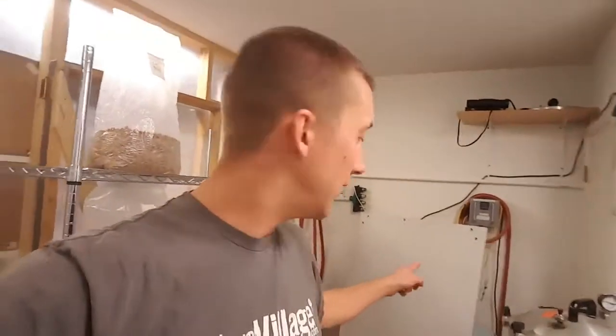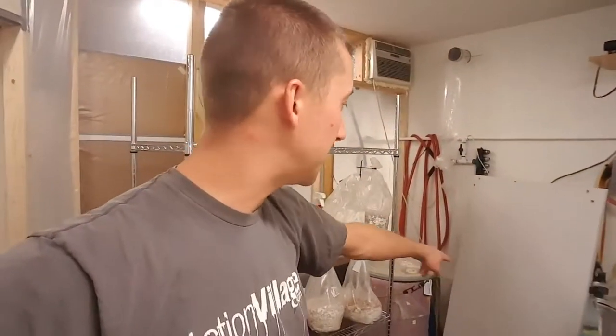Both of my HEPA filters have pre-filters on them — that's very important, especially if you're in a grow like me where I'm not in a super clean sterile room. I'm not scrubbing in and scrubbing out, and I also have air exchanging in here. Whenever I have the sterilizers and steamers running it would just be a sauna in here if I didn't vent it out.